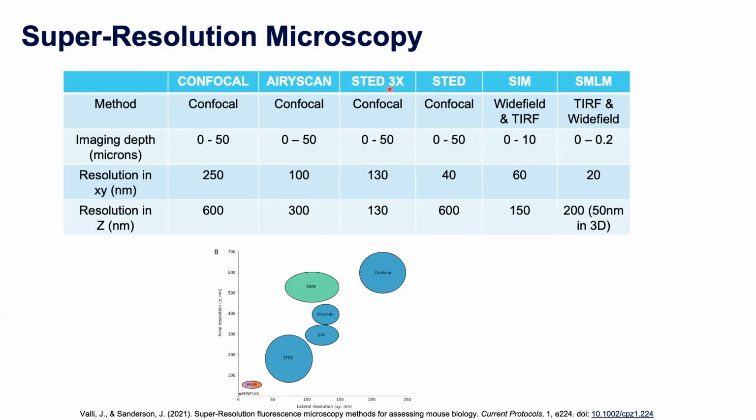That's possible to run in a couple of modes, so 3D STED, or just standard STED. In 3D STED, we get an even resolution of about 130 nanometers, whereas in 2D STED, we can go down to about 40 nanometer resolution in XY, but that doesn't help our resolution in Z. We don't have a STED system at BOM, so we won't be covering that.